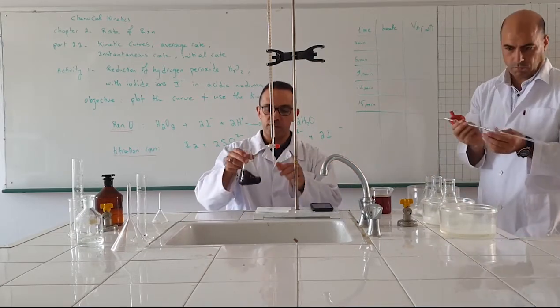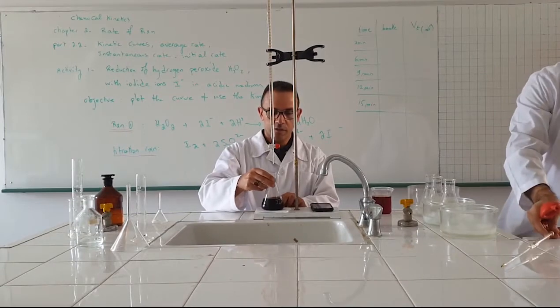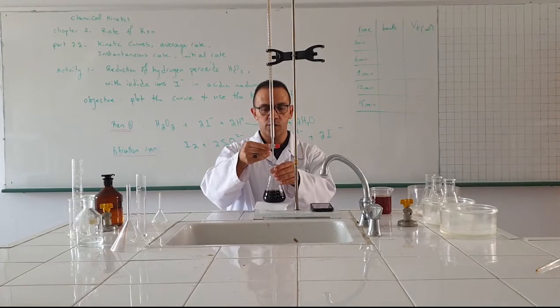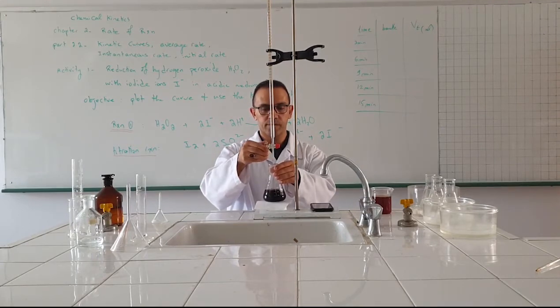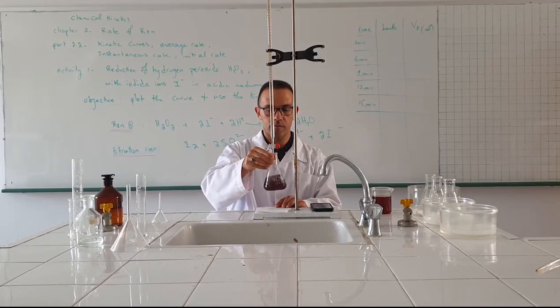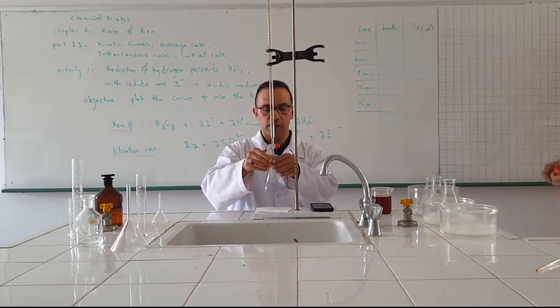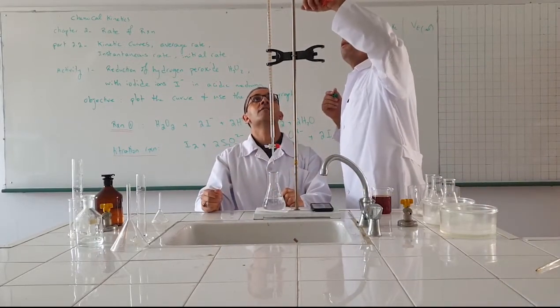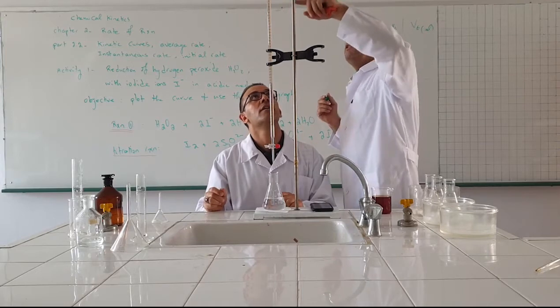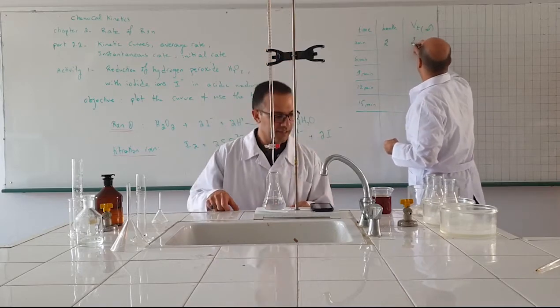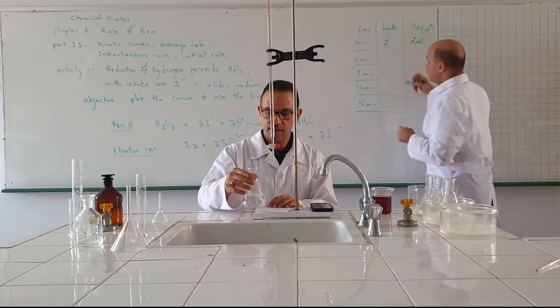Ice water, distilled water blocks the reaction. Okay, start the titration with thiosulfate solution. Now, solution is decolorized meaning that equivalence is reached. The volume or the reading of the burette is 2 ml. So, the volume is 2 ml.